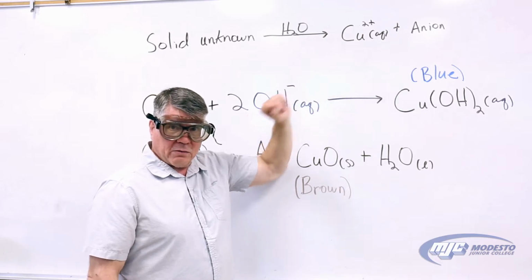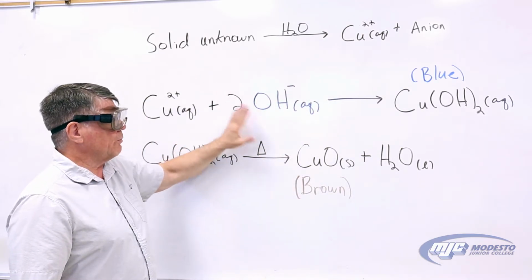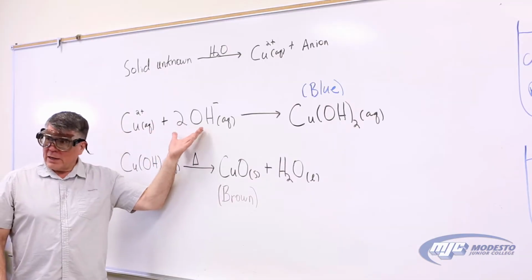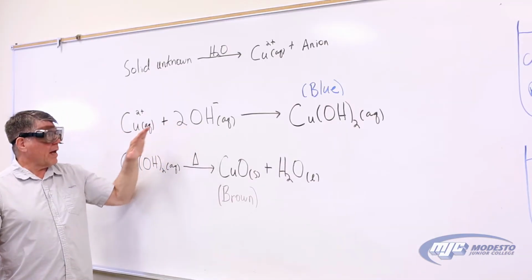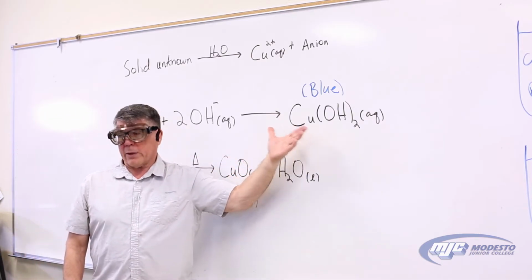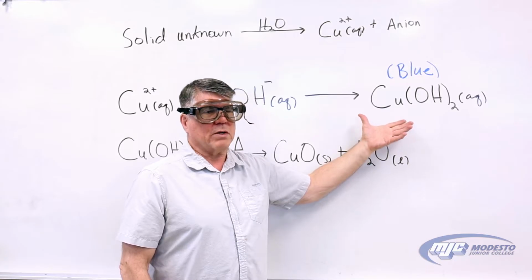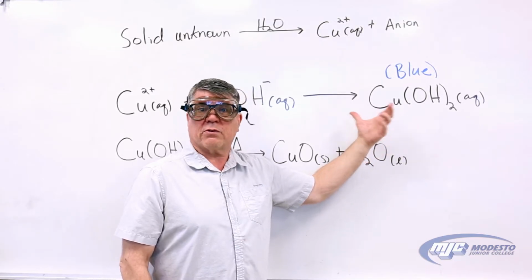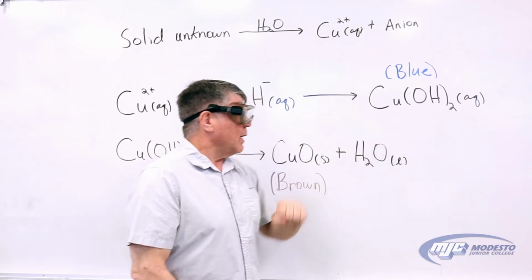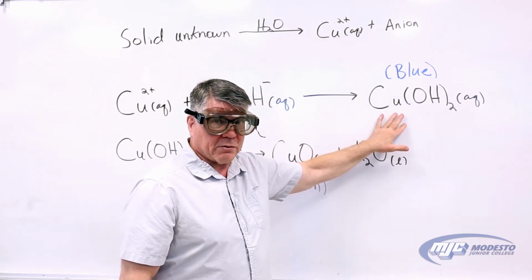What we do is we take that solution and we add some sodium hydroxide to it. Sodium hydroxide is just a source of the hydroxide ion for us. What the hydroxide does is react with the copper two ion and form copper two hydroxide. Copper two hydroxide is somewhat soluble in water, but what you'll see is it forms a bright blue slushy, but don't drink it, right? That's really hard to isolate, and we need to isolate it, which you'll see in a minute.